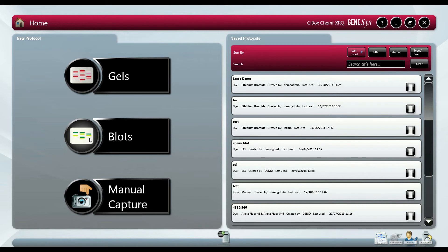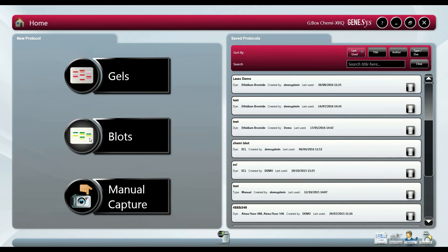This also doesn't factor in maintenance of developers and disposal of chemicals. Furthermore the fluorophores typically used in confocal microscopy will already be widely available in most labs. Here we will be looking at how to do automated western blot fluorescence in Genesis using two different band passes.